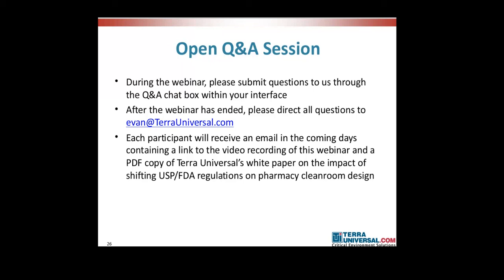Thank you, Chris. This question is from Matthew. Will the 12-hour beyond use date exemption be affected by the USP 800 FDA regulations? Chris, do you know the answer to that? Yeah, no. USP 800 and CGMPs do not have any exemption for the 12-hour beyond use date. It's USP 797 that's going to allow for the ISO 5 primary engineering control, as they refer to it, to be located in a segregated compounding area, provided that you do assign it a beyond use date of 12 hours or less.